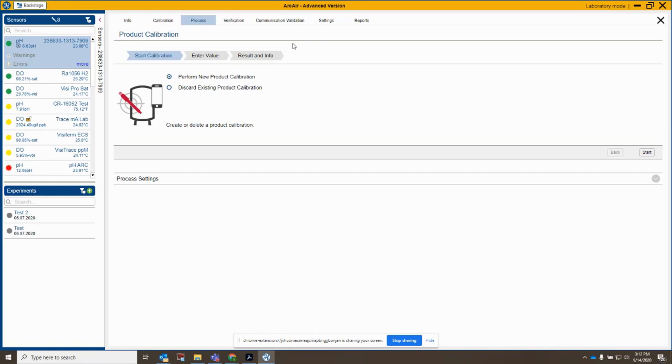So that is two-point and single-point product calibrations. And please let me know if you have questions.